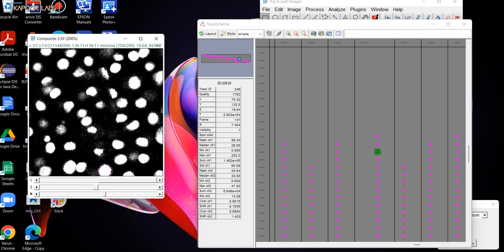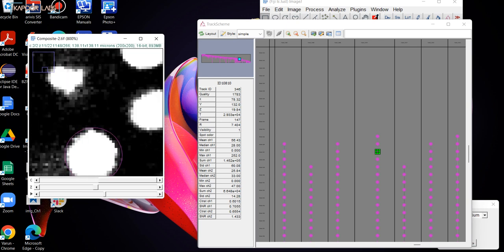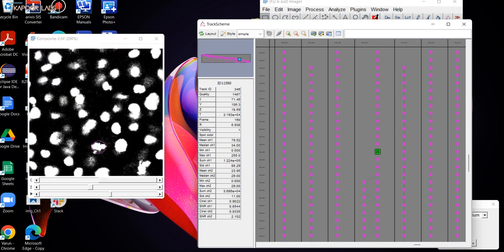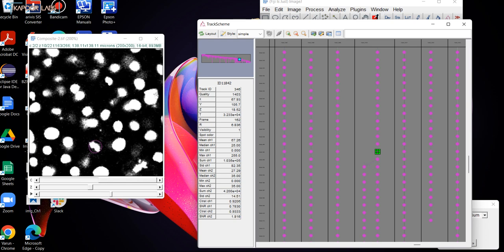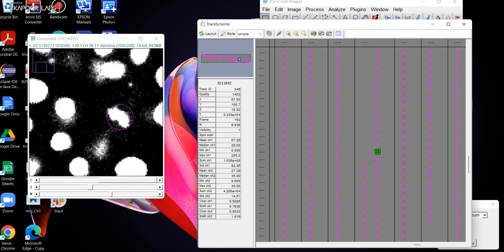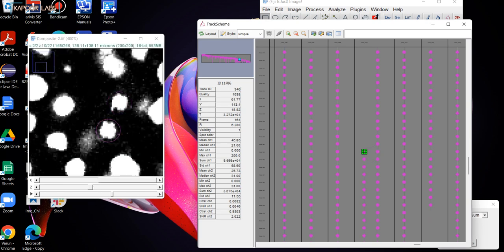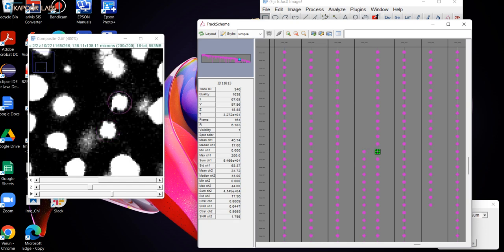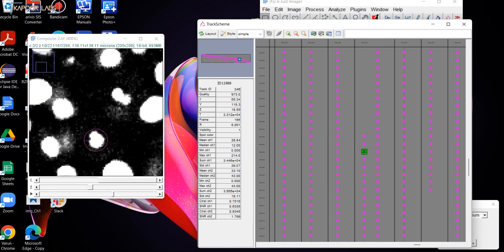So the cell that I'm following now is at the bottom, this one. Just gonna zoom out. So keep an eye for this cell, and now we are following this in the lineage tree or the track scheme, and it is supposed to divide here, which is kind of true. It assumes the kind of metaphase shape, and then it splits. And again, the good point is that you have found the mother cell, then you have found these two daughter cells, and now whatever happens after this, once you're following these cells, is going to be correct.